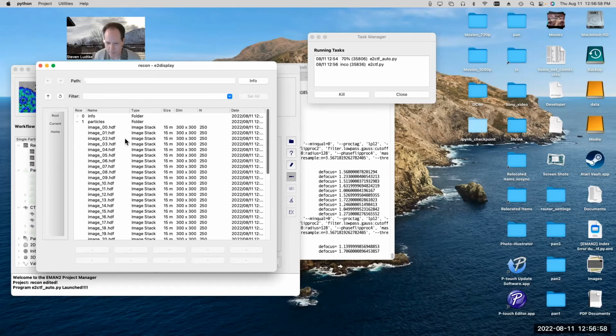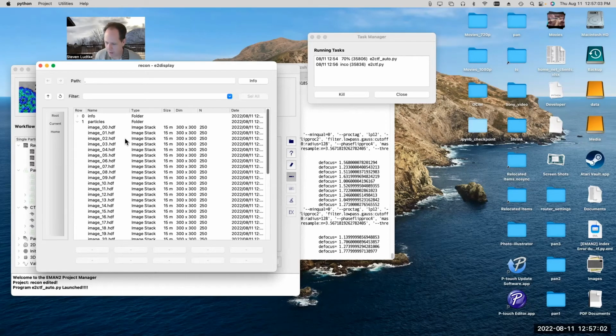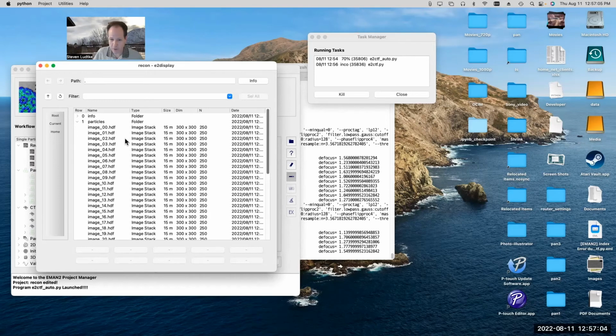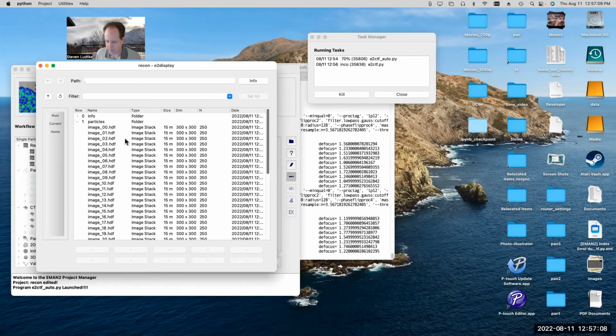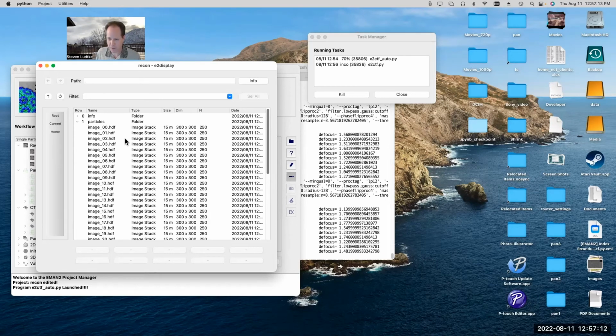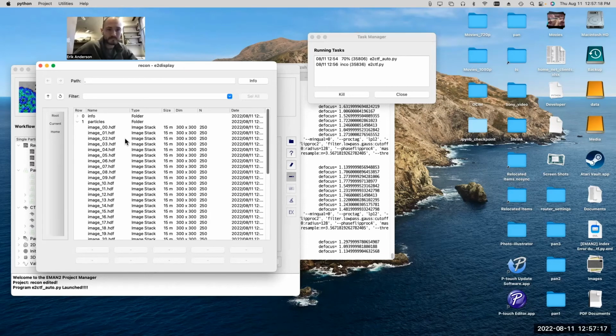The one that people use most often nowadays is from Nico Grigorieff's lab, for whole micrographs. At the time, it came out with very accurate results, but it was extremely expensive computationally to run, right? I mean, your computers were 100 times slower back then.